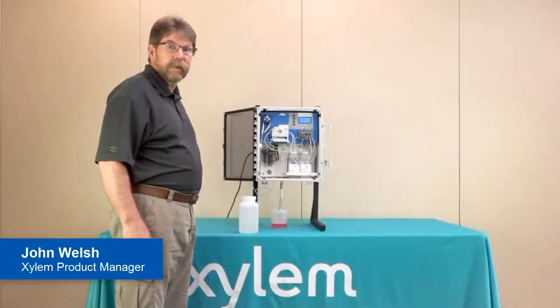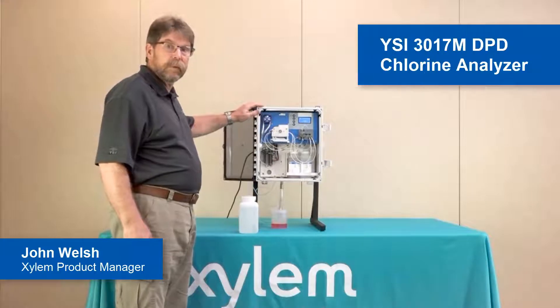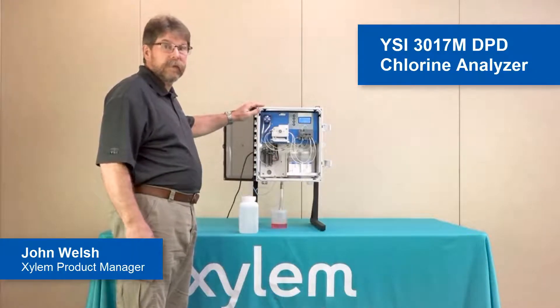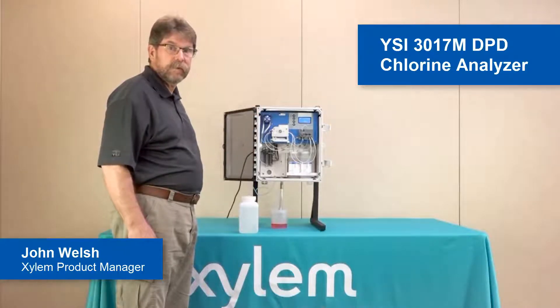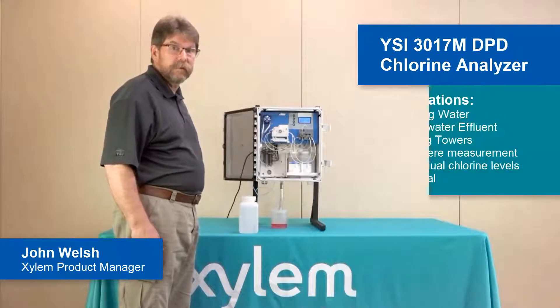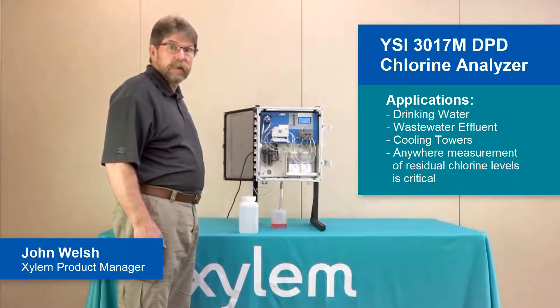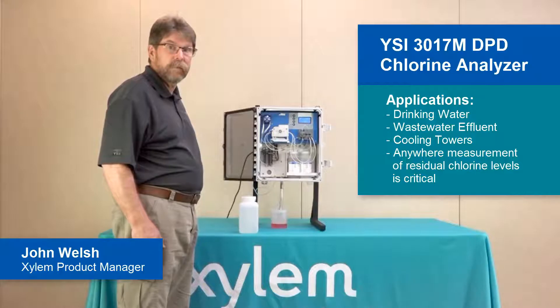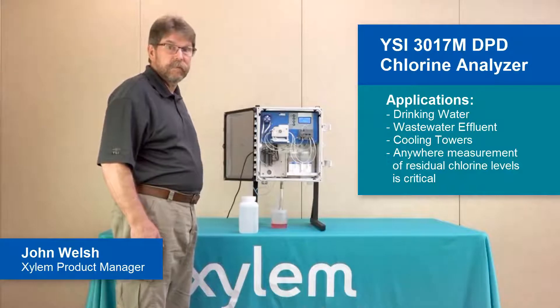My name is John Welsh and I'm a Xylem Product Manager, and this is the model 3017M Chlorine Analyzer. The model 3017 uses the DPD colorimetric method for the determination of chlorine. Typical applications for the model 3017 would be drinking water, wastewater effluent to ensure that all of the chlorine has been removed before it is discharged, and cooling tower applications.